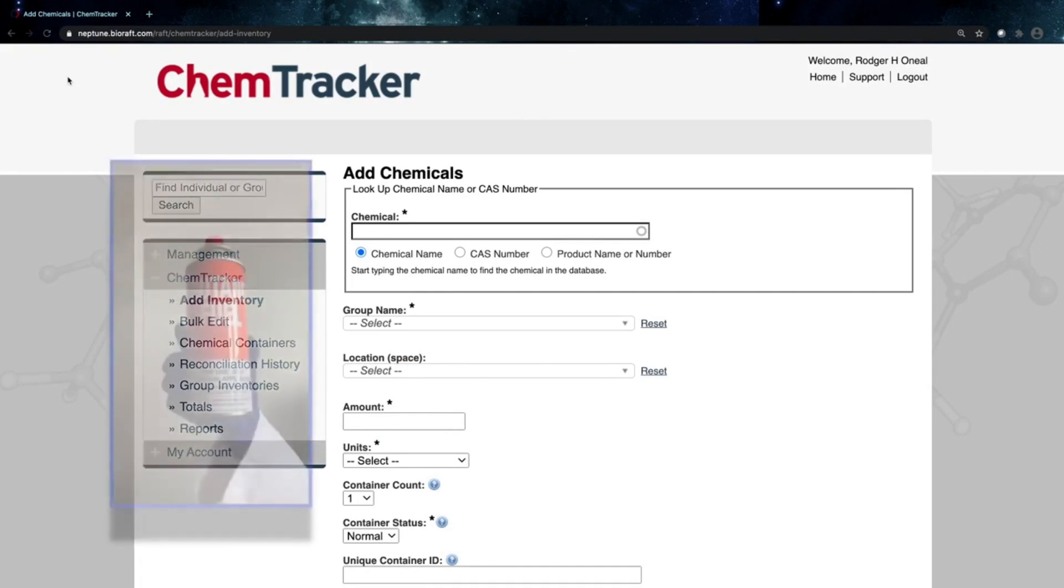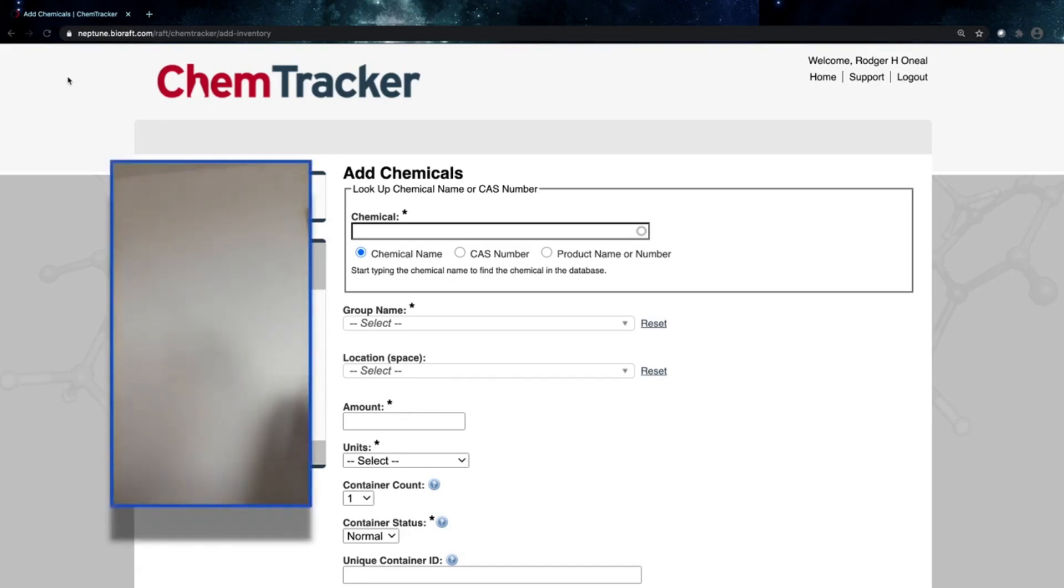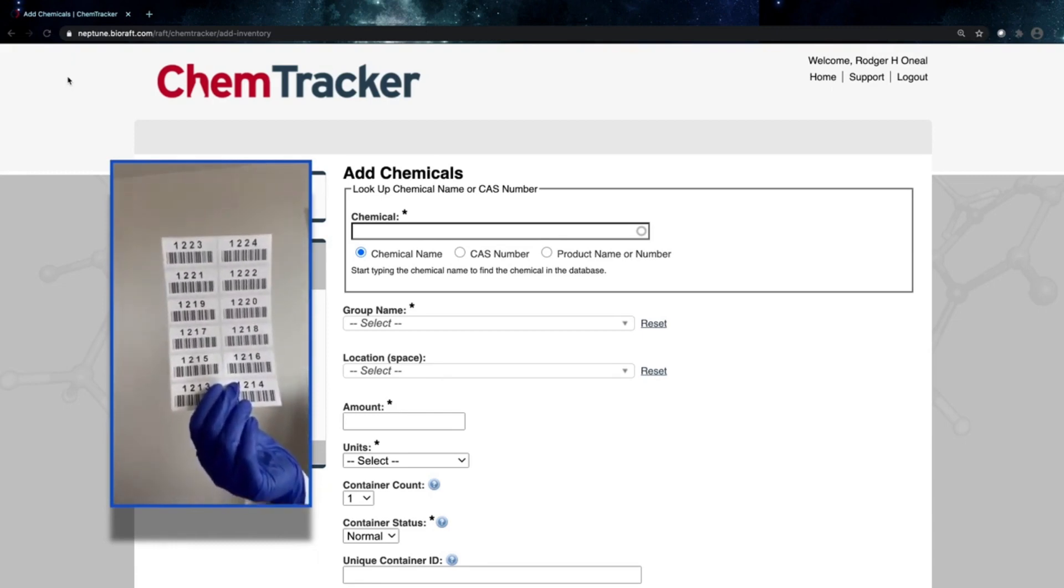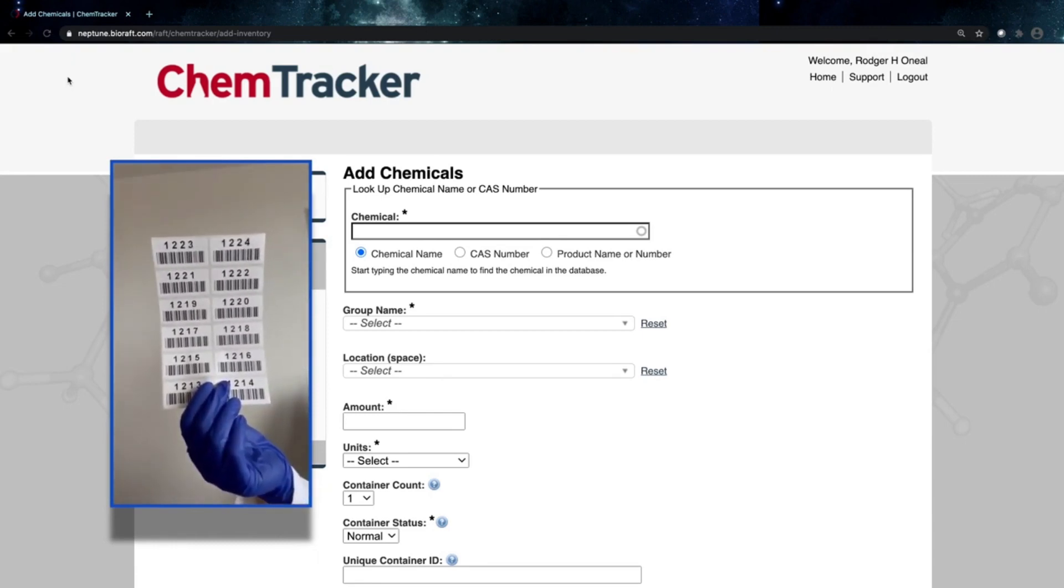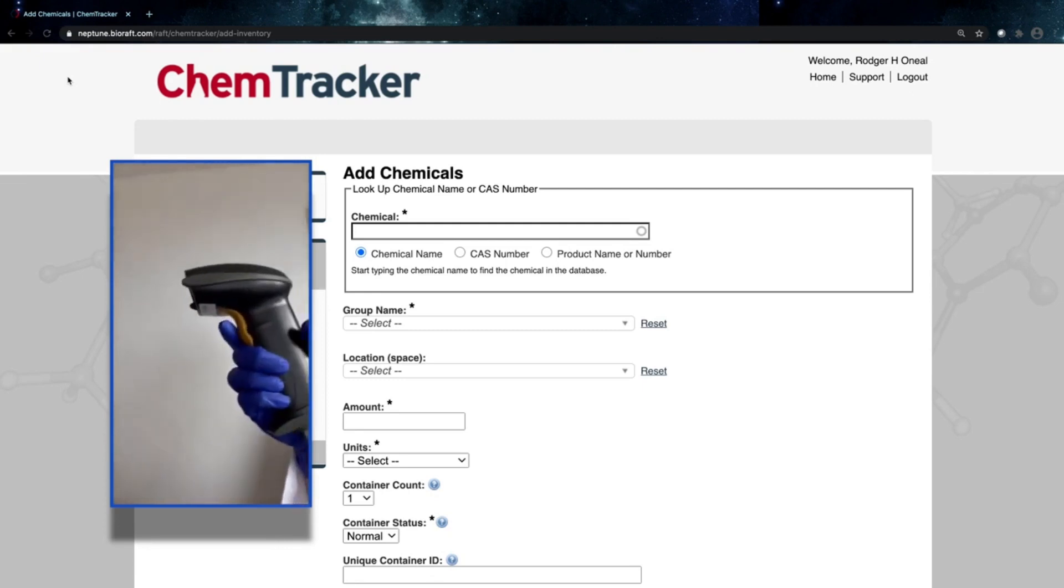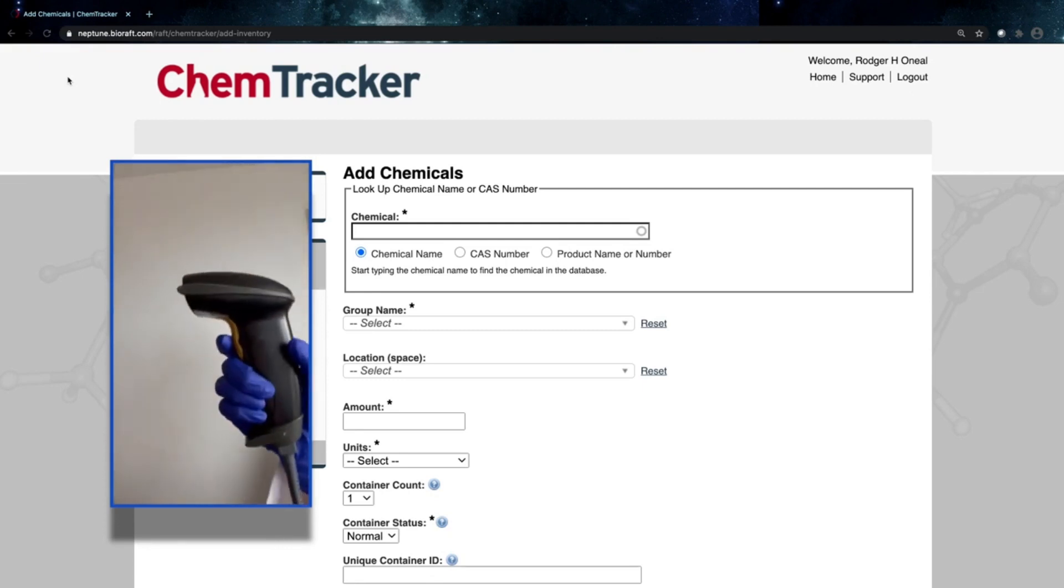Now what you'll need for this, you'll need your chemical. Today we have a container of butane fuel we're going to be entering into our inventory. You'll need your labels. We have simple pre-printed barcode labels for use today, as well as a scanner.